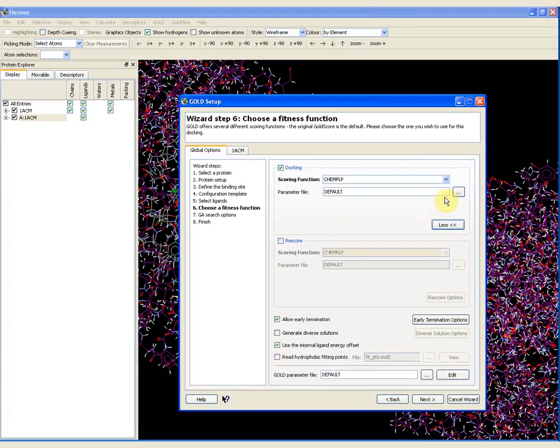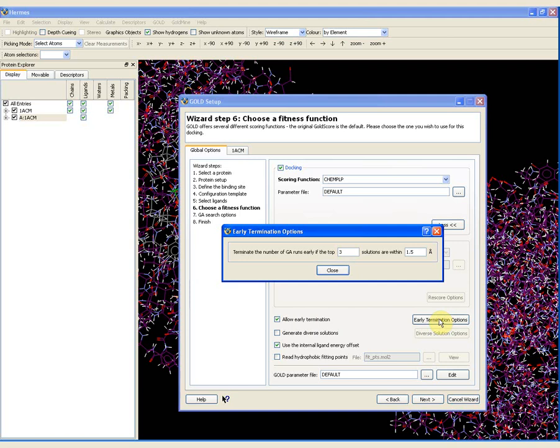If I click on the more button, this drops down all the different options. All these default options are appropriate for this particular demonstration. I am going to point out in particular that the allow early termination option is ticked on. This means that if the top three solutions are within 1.5 angstroms of each other, the genetic algorithm will terminate instead of running all the way up to the 10 requested genetic algorithm runs.